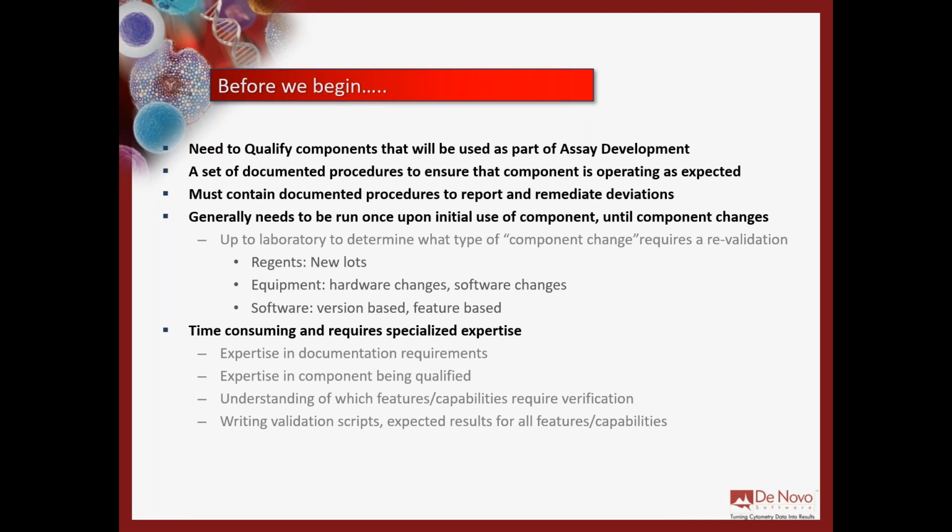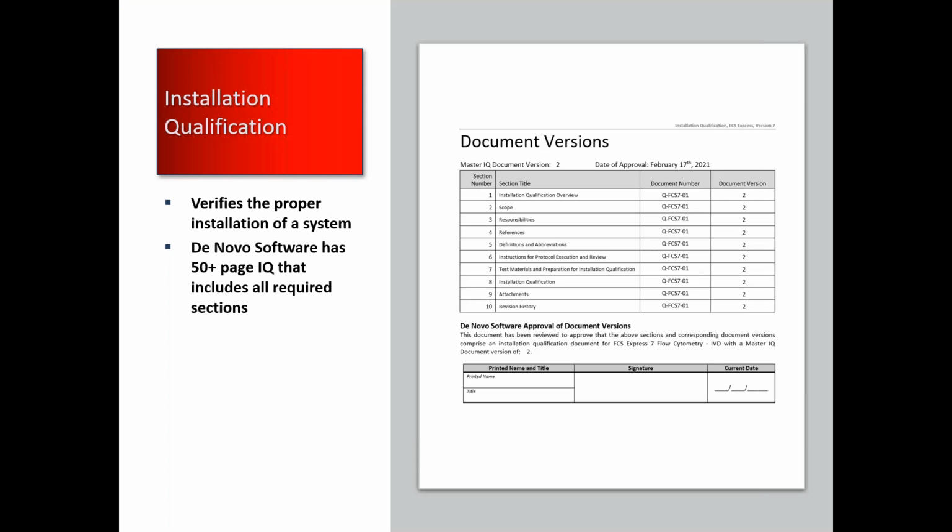And you need somebody who has experience writing validation scripts to accurately write scripts that will comprehensively test the component that you're looking at. So this is all very, very challenging, very, very time consuming. And the average lab person might not have the expertise even to know how to do this, and you need specialists all working together.